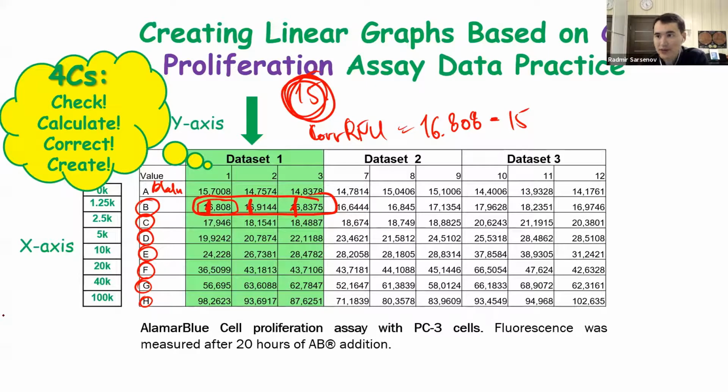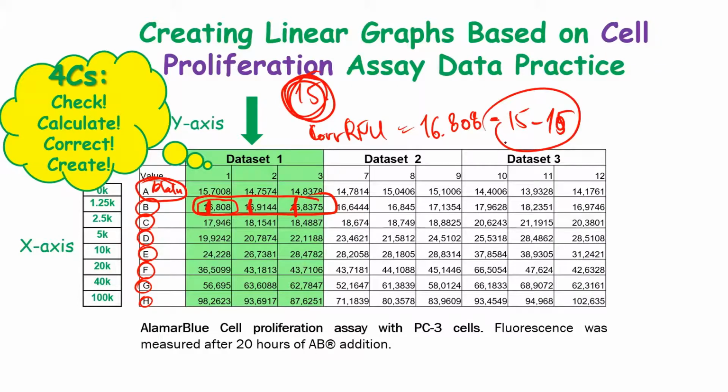Okay. So your blank is the background that you exclude from your calculations. And the blank shouldn't go into the graph, right? Of course, because in your graph, 15 minus 15 would be equal to 0. Okay, thank you. You're welcome.